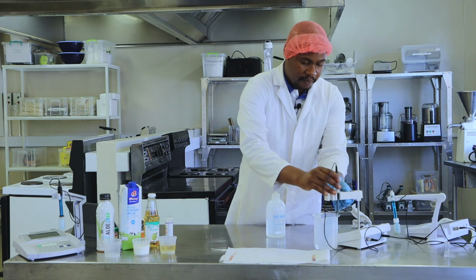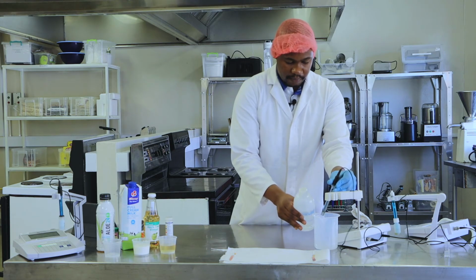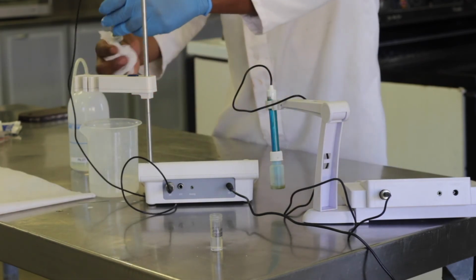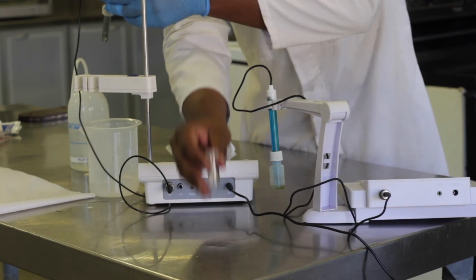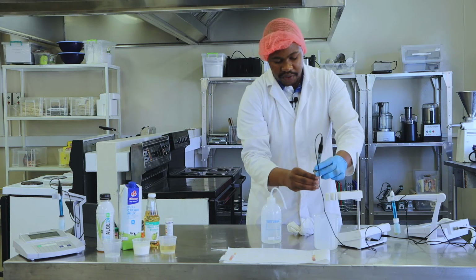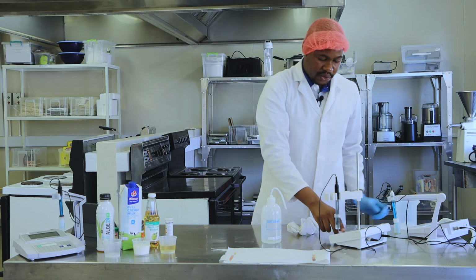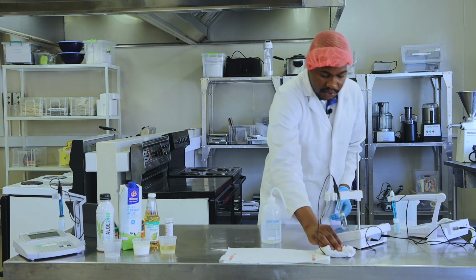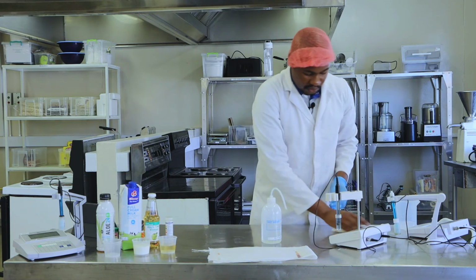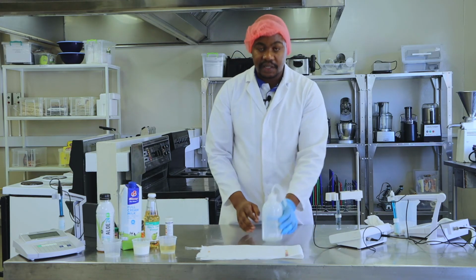Your pH probe here should be washed. Blot it with paper towel, and then it goes to the storage solution. So you immerse it in the storage solution, and then you close it, and then you can put it here, and you can switch off the pH meter to save electricity. And then you make sure that your bench is completely clean. And then now I'm going to go back to my test strips.